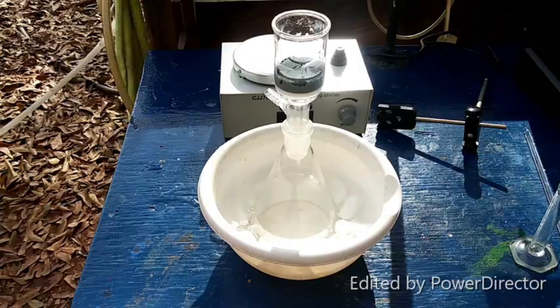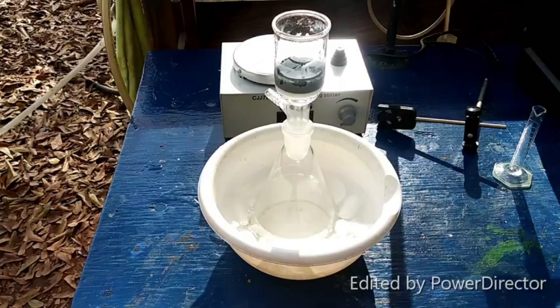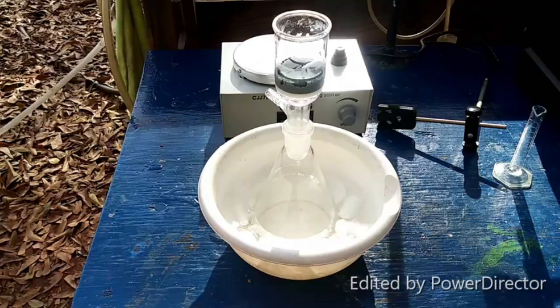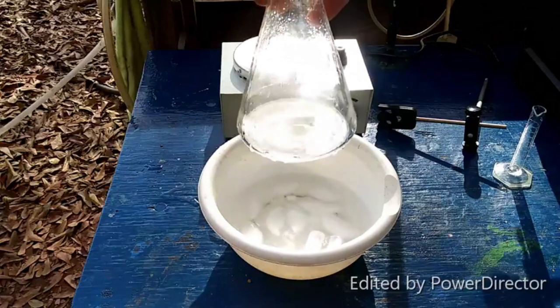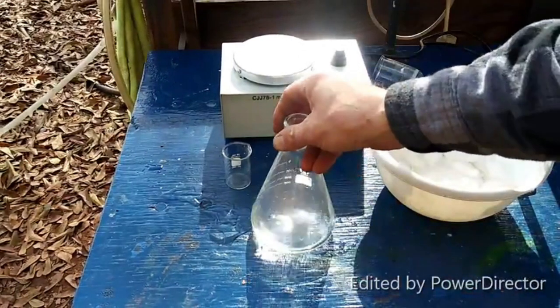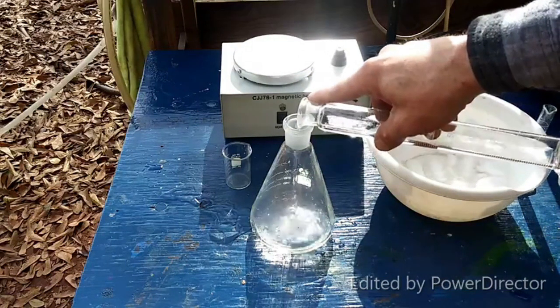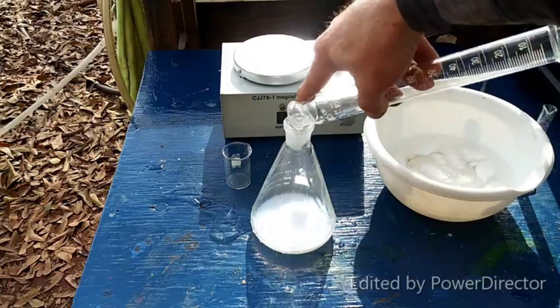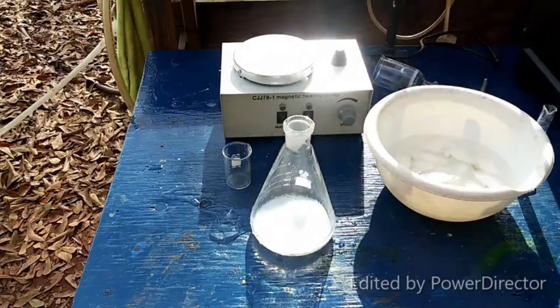According to the text, you can either use this impure solution as-is, or precipitate out the sodium dithionite. Here's our solution — we are going to add 37 and a half milliliters of absolute alcohol. The instructions say to put this in a freezer for a little while to allow all of the dithionite to crystallize, so I'm going to go ahead and do that and come back when there is something to see.